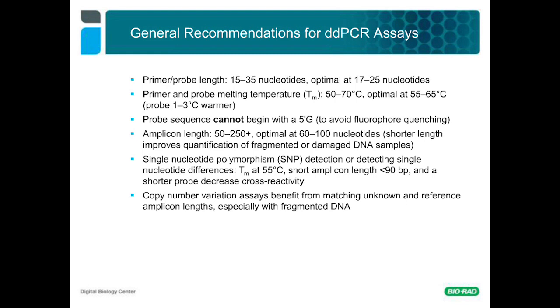ddPCR assay design can be flexible, and many rules can be and sometimes must be traded or broken in order to optimize for the target of interest. A wide range of primer and probe lengths can be used. There's no need to have a G or C on the primer ends or to have the probe 10 degrees higher in TM than the primers. With that said, if this convenient, familiar rule from these two suggestions can provide a benefit in some cases, then feel free to use them. Also, amplicon length is one useful way to multiplex in EvaGreen.